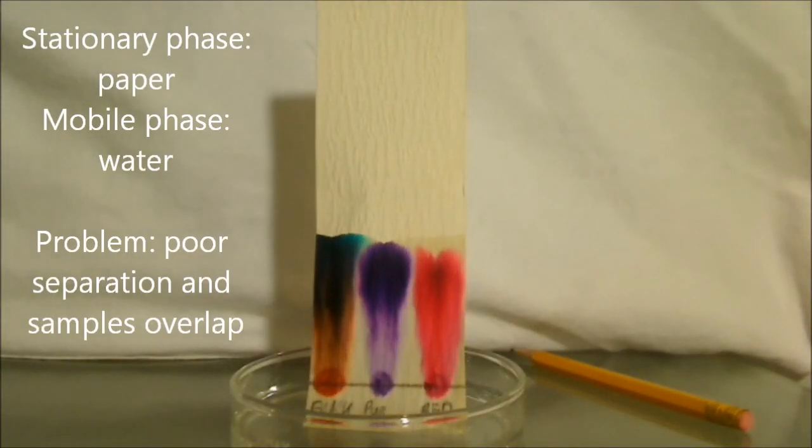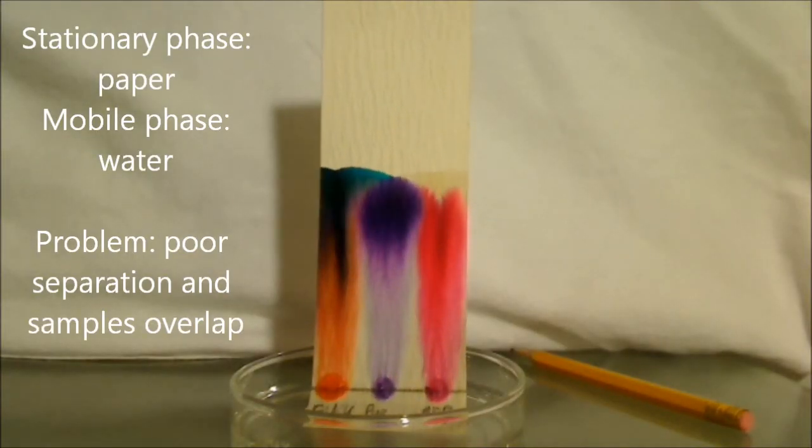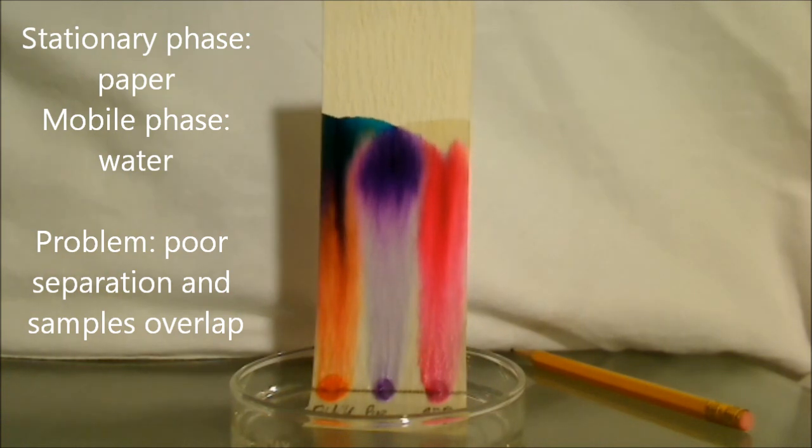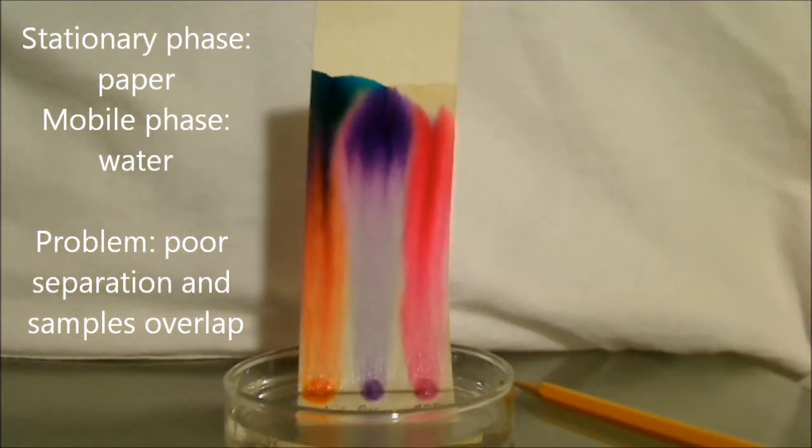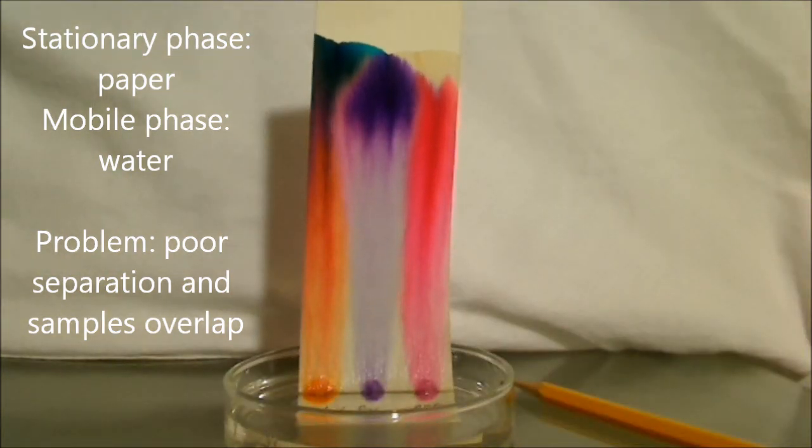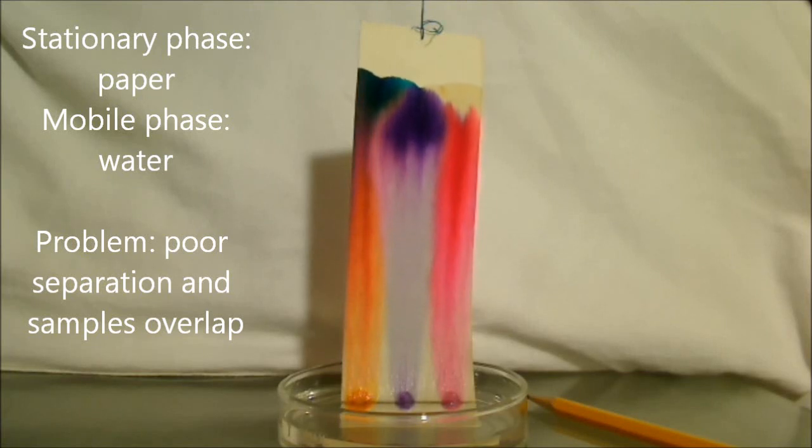So it's not so easy to do this. Let's look at some bloopers. In this case, the inks are starting to overlap. That's one problem. And the second problem is that pretty much all the ink is going up all the way. There's not very good separation into different spots.